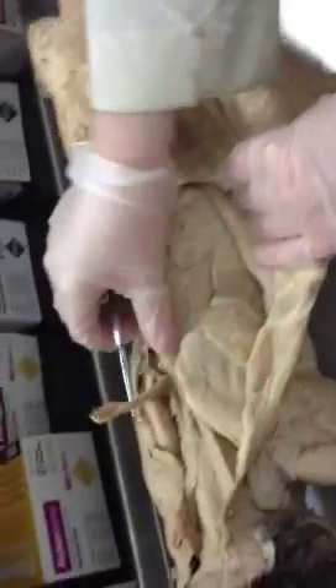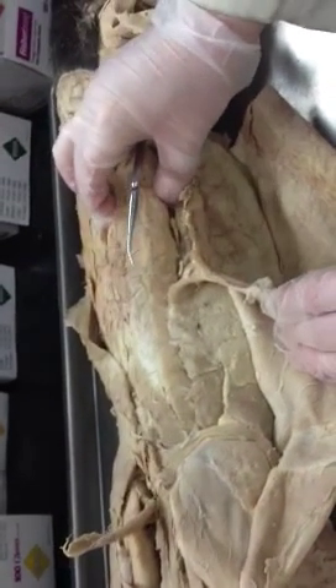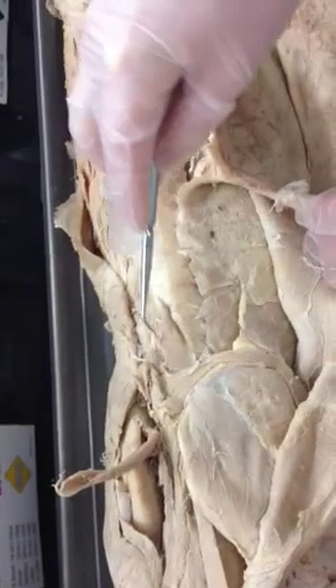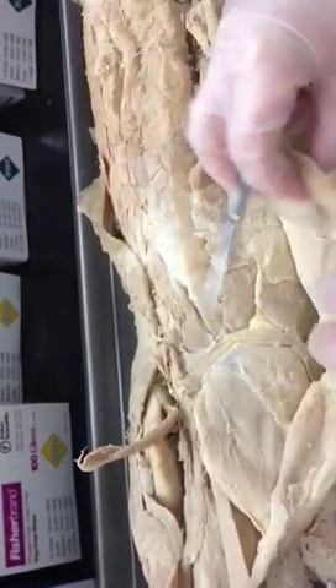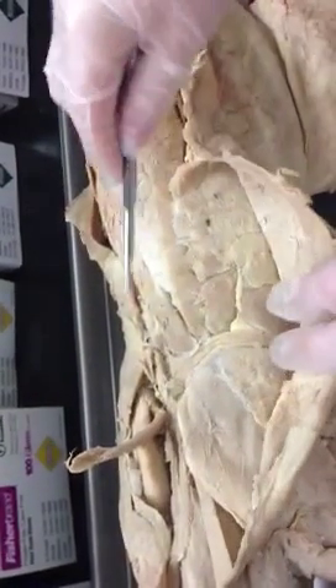Moving to the deep muscles of the back — you remember we had three columns. These muscles are huge in this cat. On the upper part of the back here, this is the spinalis dorsi, which is part of the spinalis column. It's roughly underneath the spinal trapezius.